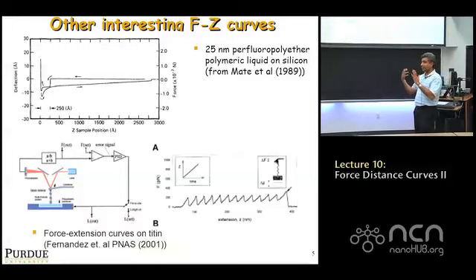So what ends up happening is, first, the tip of the cantilever approaches the sample, and you've got a very thick layer of liquid, and at a certain critical distance, the liquid just wicks up, forming a meniscus, really causing an instant negative force. The surface tension tries to pull the cantilever down. That's the first jump down you get as you approach the sample, right? You see that? So that's this one. That's the first snap in, if you will, that occurs. It's because the liquid just wicks up and sucks.